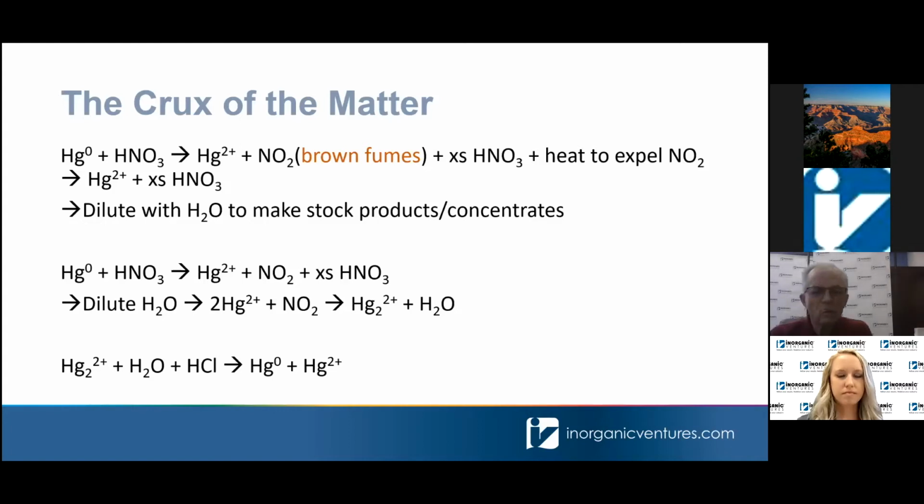And we have 3 different ways of checking the mercury content. One is with an EDTA titration. Now that titration reacts only with mercury in the +2 state. Another one is ICP assay, which will detect any mercury that's in there. But if it's in there as free elemental mercury, it'll give a false high result because of a higher nebulization efficiency, the vapor pressure of the mercury. And then we do just the elemental weighing it out as a gravimetric is the third way that we check.